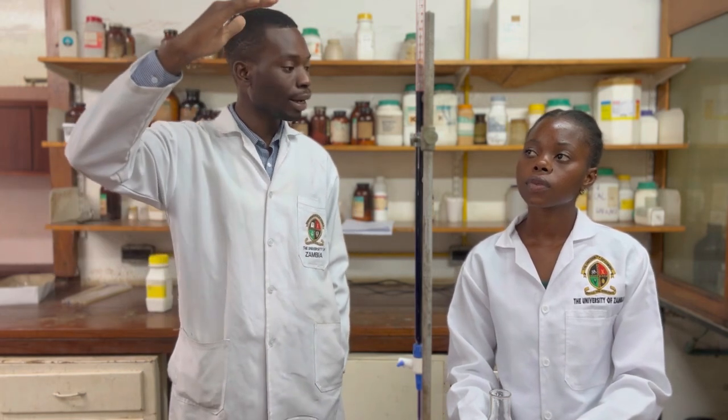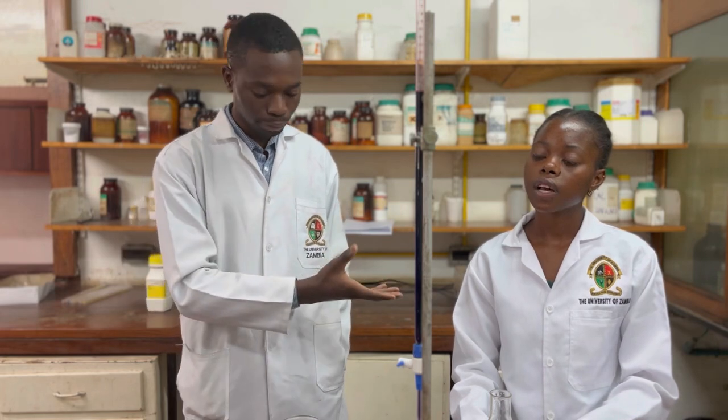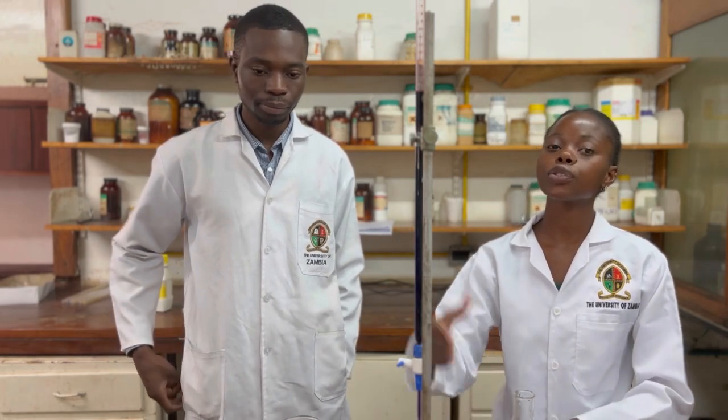Okay, so we're now back in the lab session. We're trying to discuss the technicalities of the procedure and see which reagents we're working with. One thing we should understand is that the first part has already been done. In your lab manual, the two most important parts we're supposed to focus on are part A and part E. The first part of A was standardizing the potassium permanganate, but it has already been standardized for us.